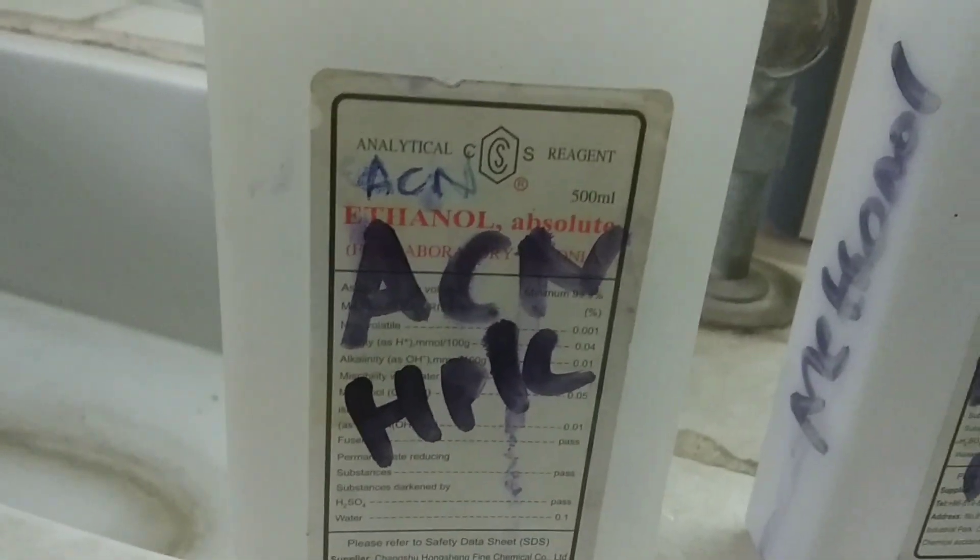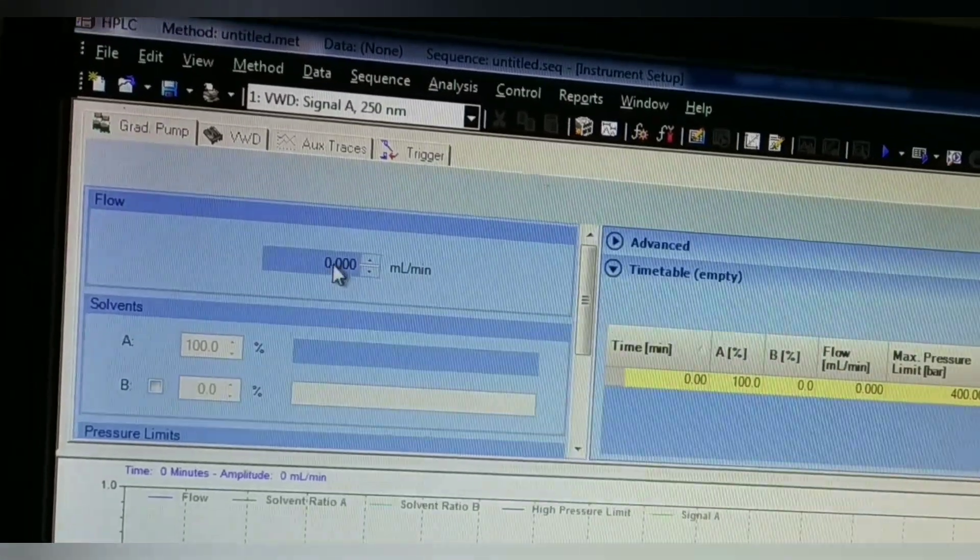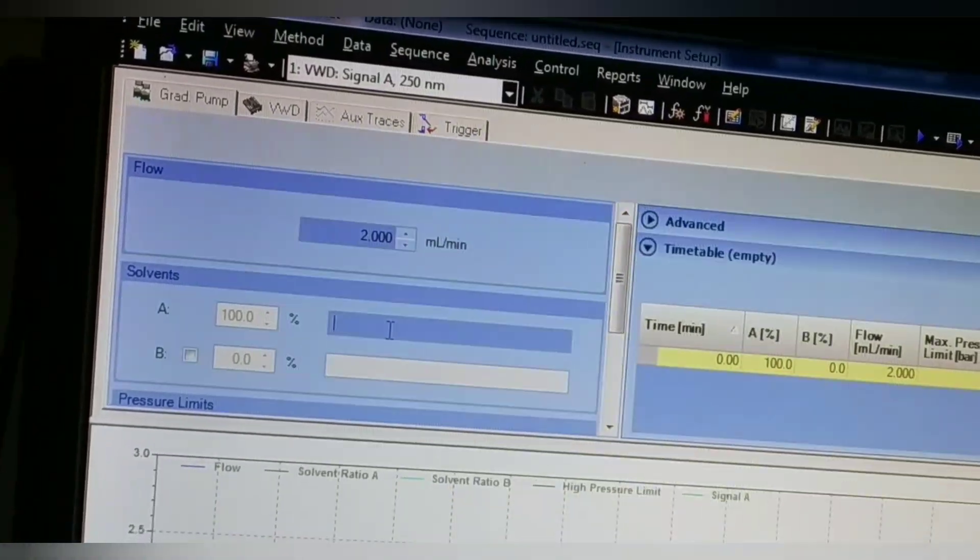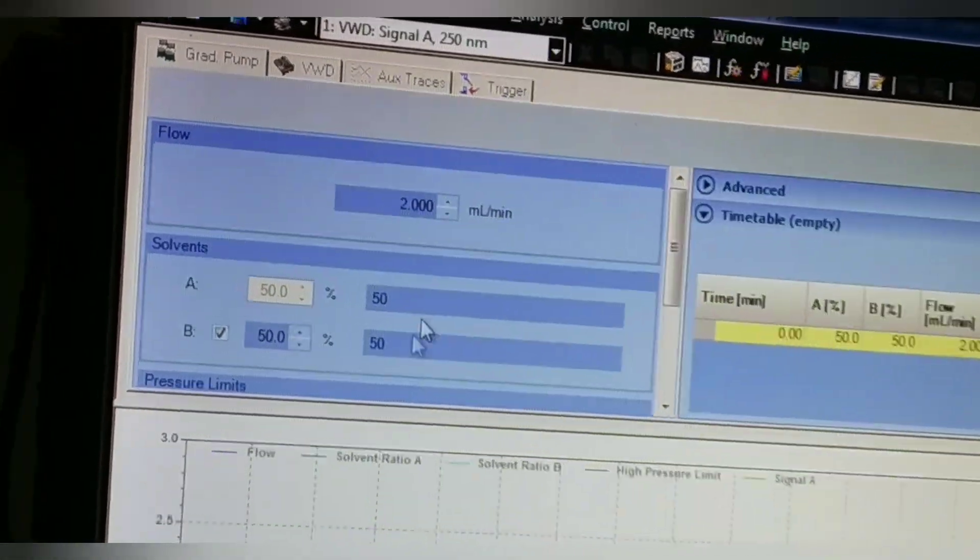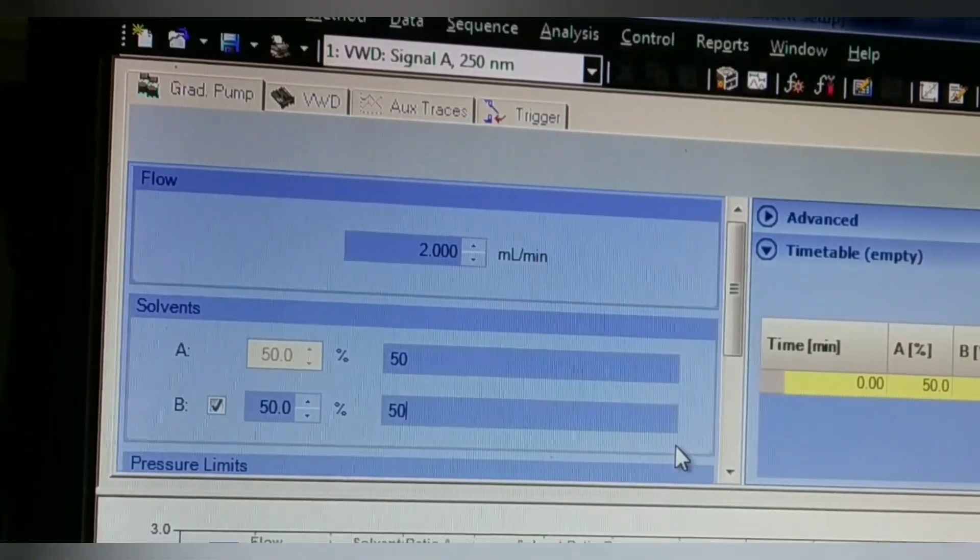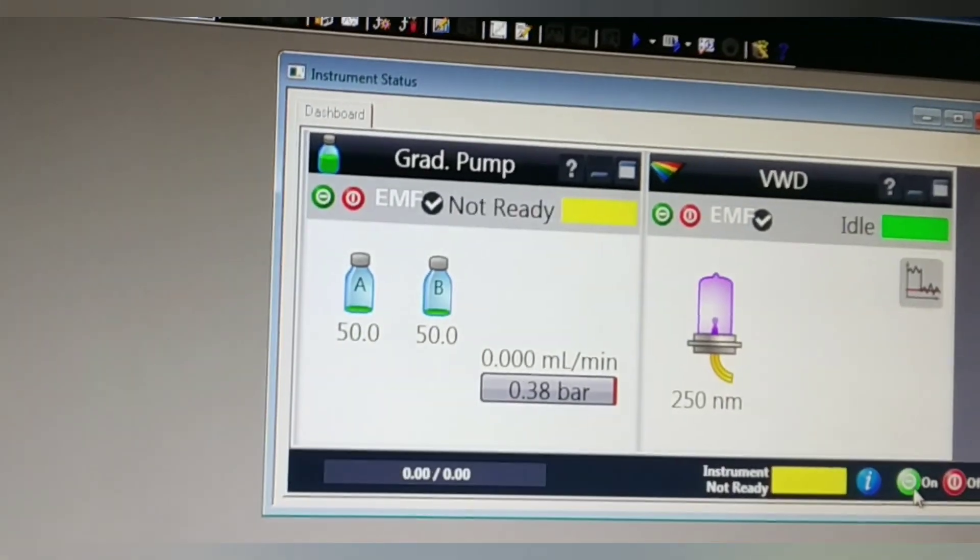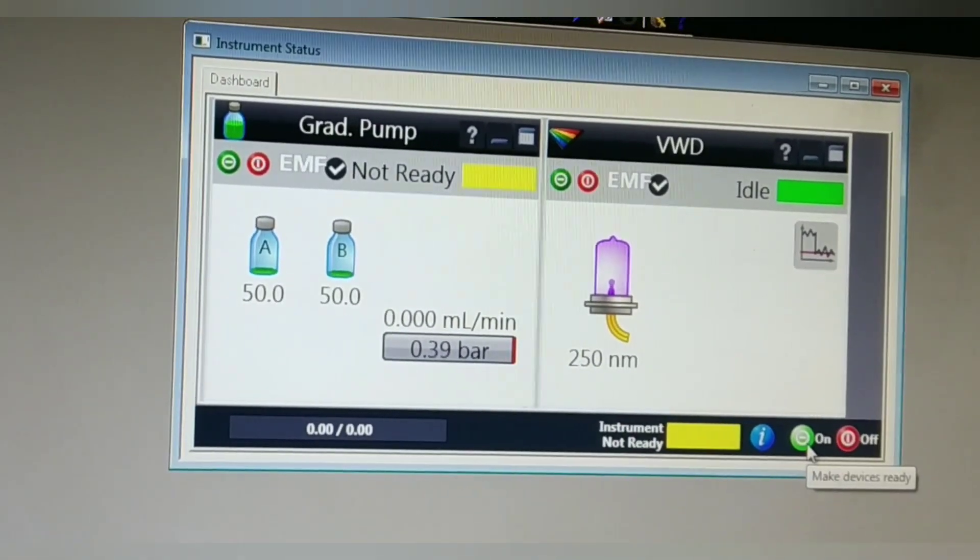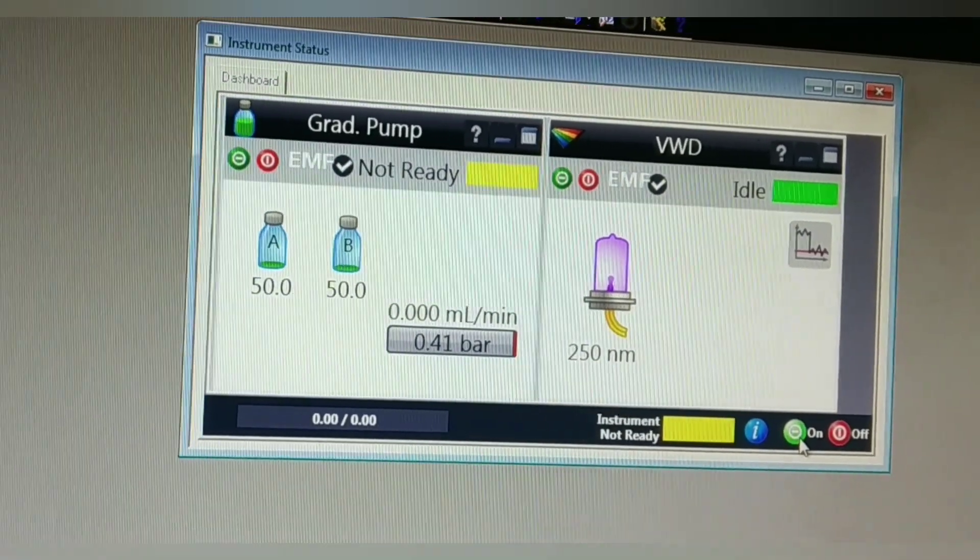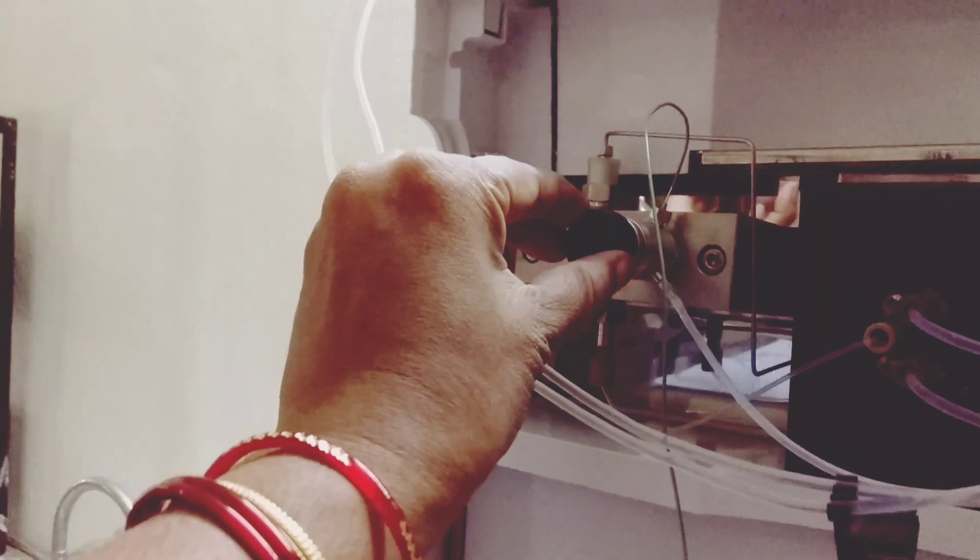First of all, I'll be opening the settings of the software and then set the mobile phase ratio to 50 to 50, which is being shown here on the screen. Both the reservoirs A and B will be filled with warm water, and then I'll be opening the purge valve so that purging starts.